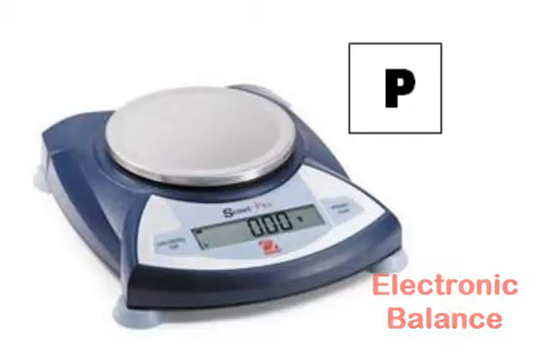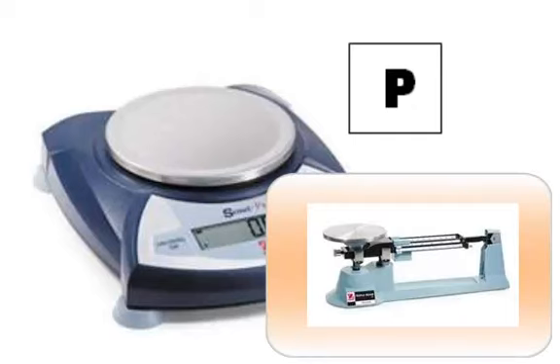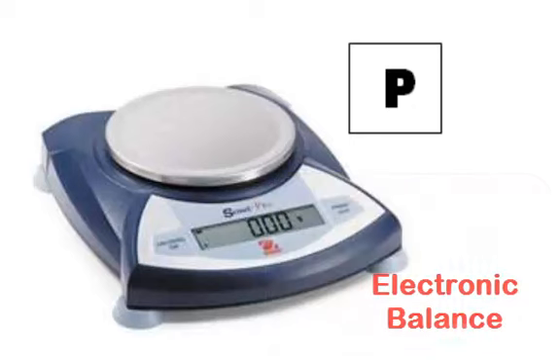In sixth grade, you might have used triple beam balances where you move them around, kind of like the scales at the doctor's office that you might see. But we're gonna be using electronic balances because they go faster and sometimes we don't have a lot of time in the lab to be using the triple beam balances.